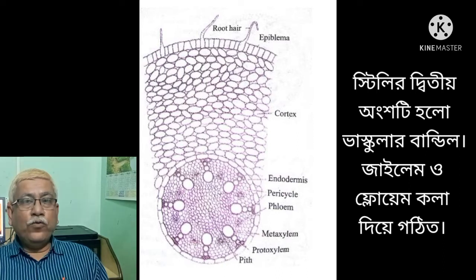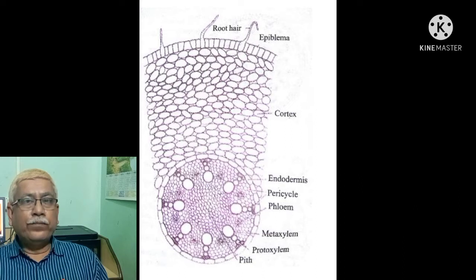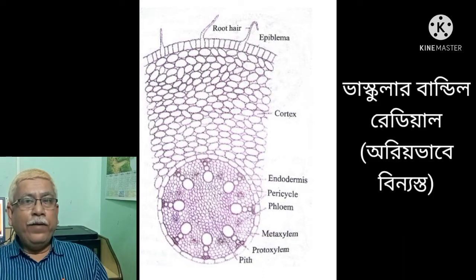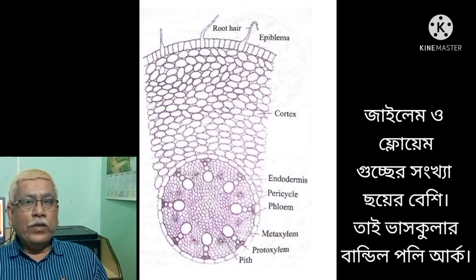Vascular bundles consist of alternating strands of xylem and phloem, so the vascular bundle is radial. The number of xylem and phloem strands are more than six, so the vascular bundle is polyarch.